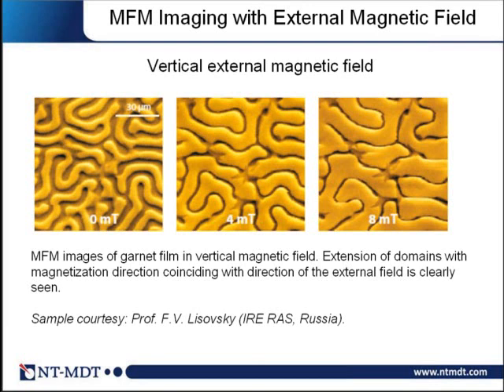You change the domain structure, but ordering is not seen here, and it is clear why, because the in-plane magnetic field breaks the in-plane symmetry, and it is not surprising that domains on the previous slide were oriented correspondingly. The out-of-plane magnetic field doesn't break the symmetry. Therefore, changes of the domains are seen, but they are still symmetric with respect to rotation in plane.